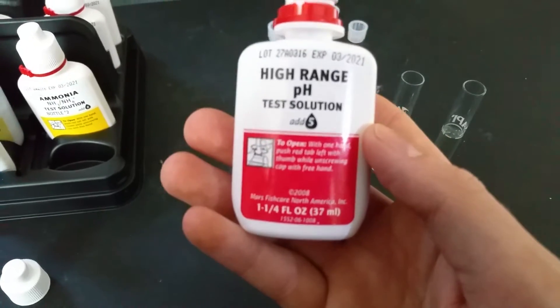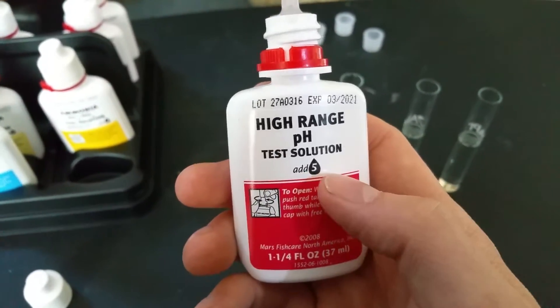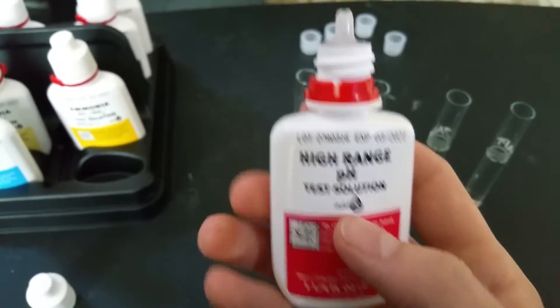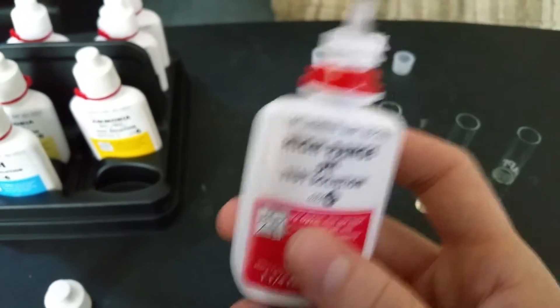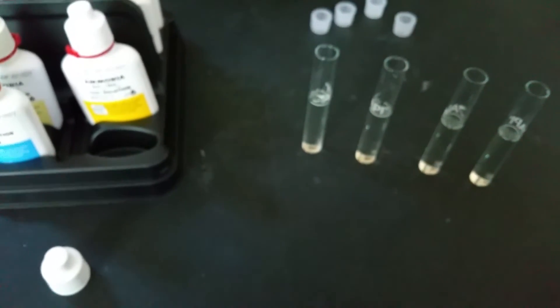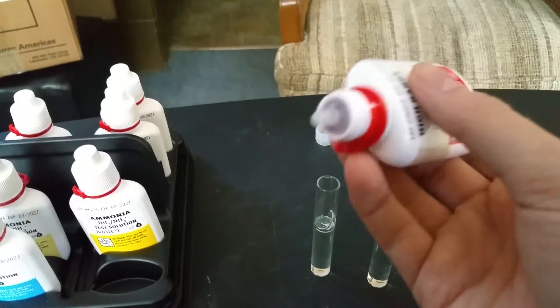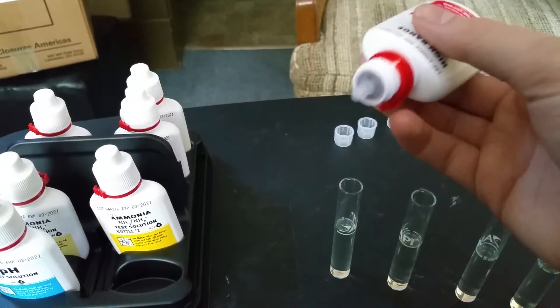What you want to do is read however many drops the test you are performing requires. So this one has 5. I also recommend shaking the bottle a bit before you start — just give it a few shakes. Then keep the bottle straight down and put in 5 drops.